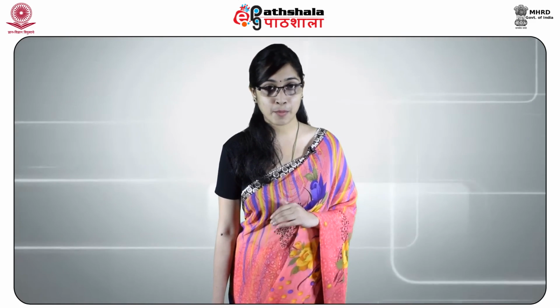The ratio of diameters of the medulla and the hairs measured at the thickest point is known as the medullary index. Vacuoles give characteristic formations in certain species which are useful in their identification. They are also known as the air bubbles.